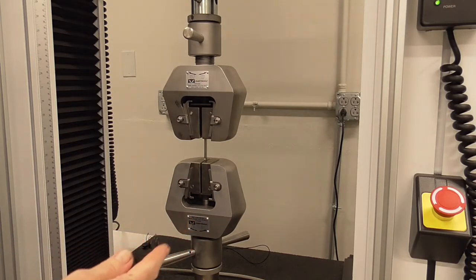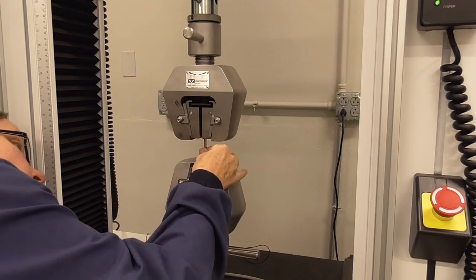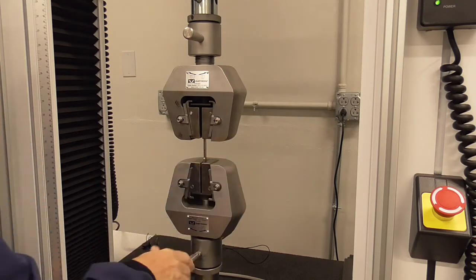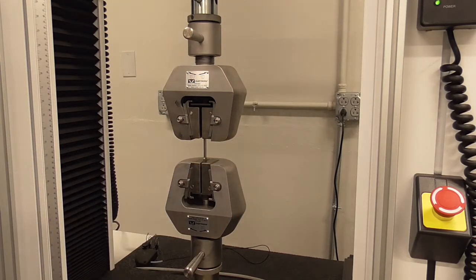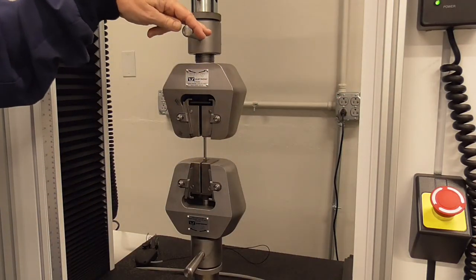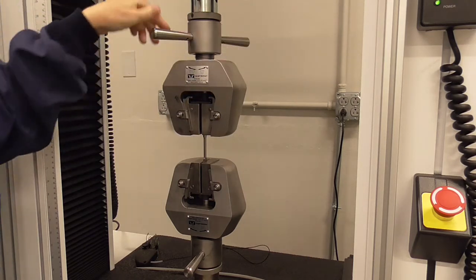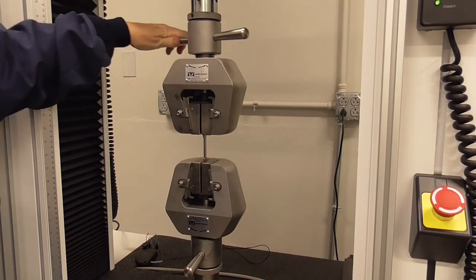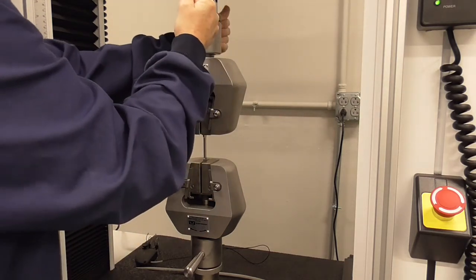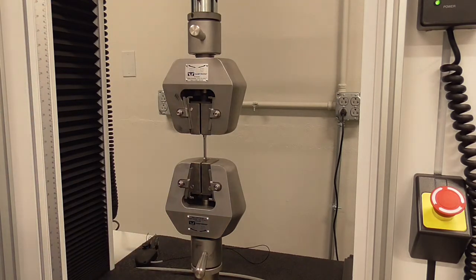Make sure the dog bone is straight up and down — vertical. Jog the grip, tighten the top, then do one last snug tightening. Close the door.